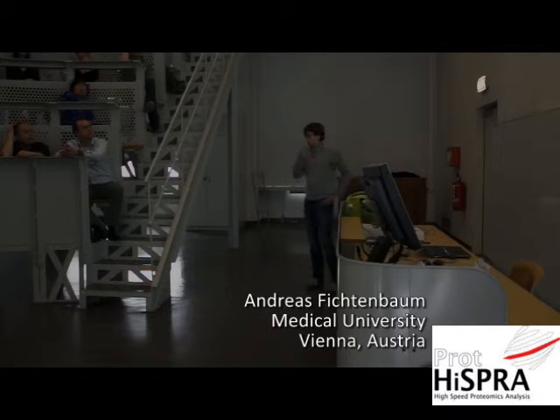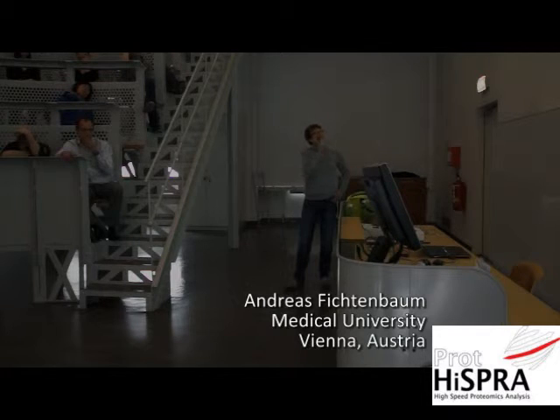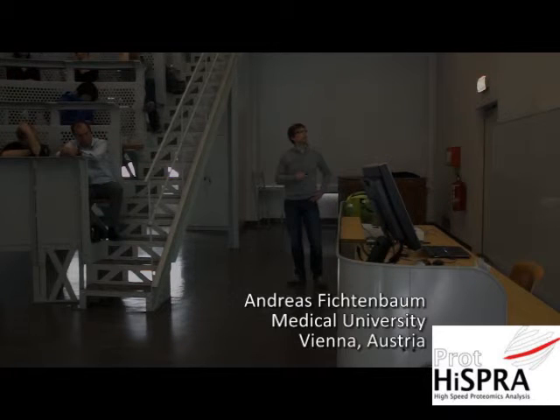So I want to start to summarize the first part. So the separation conditions for the reversed phase were optimized and tested also with a complex biological sample digest, as shown here. The next step for this part should be to implement it online to perform a fully automated system.